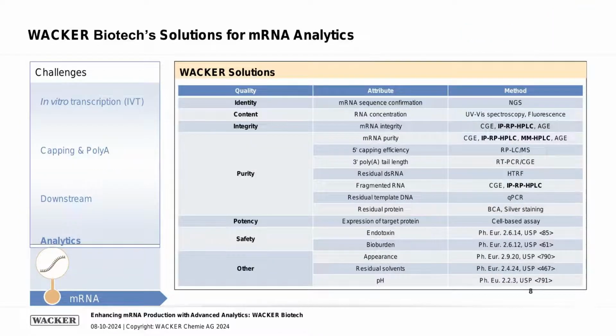All right, in the second part of the talk, I would like to put the focus more on mRNA analytics because that's what this webinar is about today. First of all, I want to say that we try to keep our analytical methods up to date with the current guidelines. So what I'm aware of currently is the third draft guideline by the US Pharmacopoeia. I think it came out in August this year. And marked in bold are methods where we now use, in addition, a PATfix device to analyze our mRNA.